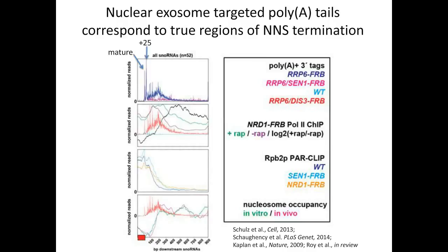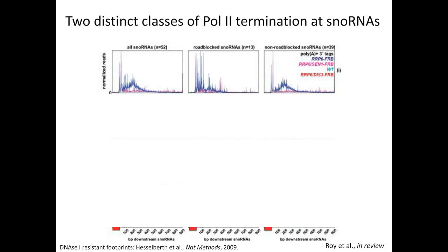However, we noticed that a number of the peaks upstream of that, but downstream of the plus 25 nucleotide peak, seemed to be highly predominant. And when we looked at these, we noticed that these peaks were directly upstream of a DNA binding protein. And so we could divide these peaks depending on the presence or absence of a DNA binding protein in the immediate vicinity downstream. And so you can see by dividing these two classes of peaks, we can clearly see two distinct classes of termination of RNA polymerase II.